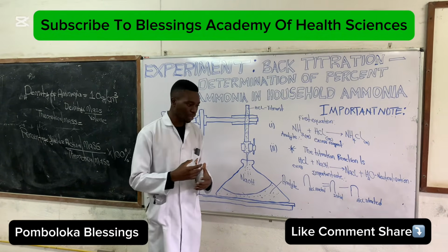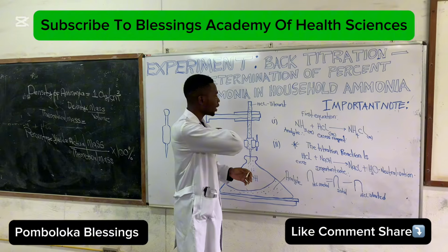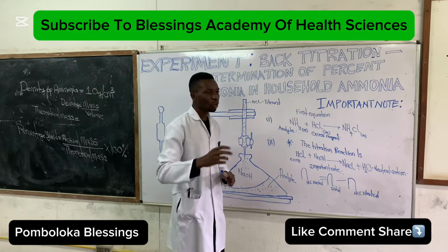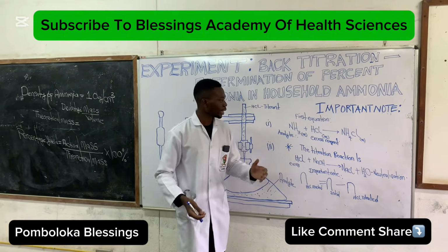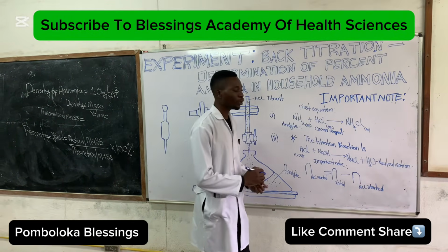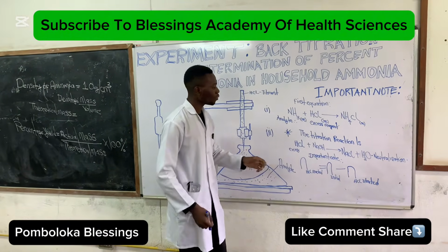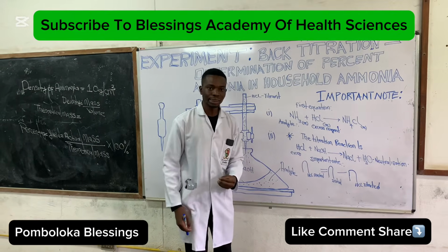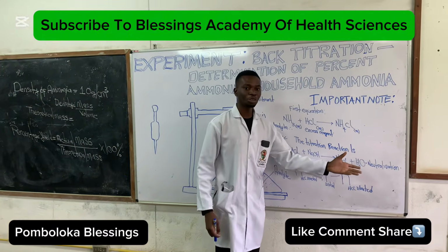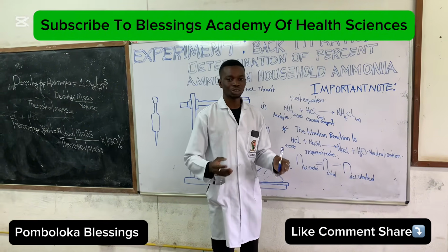You're going to be provided with ammonia, and the other thing you're given is the acid, so you're going to have two equations. In the first part of the reaction, ammonia reacts with the acid, HCl, to give us the product ammonium chloride. In the second part, sodium hydroxide, which is the base, reacts with the acid, giving us the salt plus water. Where you get the salt plus the water, that is a neutralization reaction.